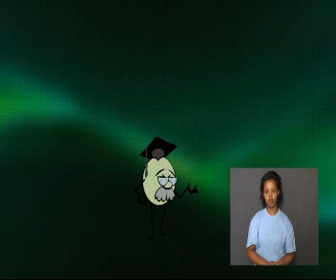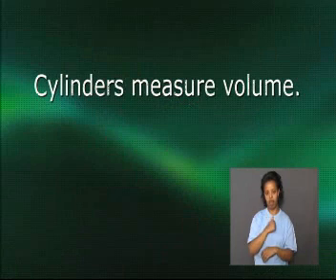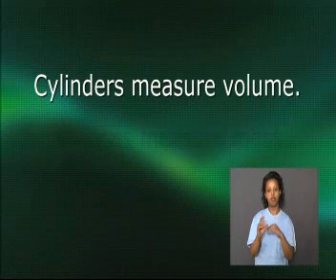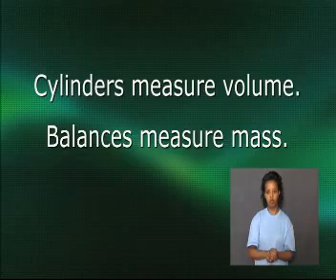Time's up. Let's get back to our lesson. Welcome back, students. I trust that was a simple activity for you. Cylinders measure volume and balances measure mass. Did you write down the same answers? If so, great work. Let us carry on with the lesson.